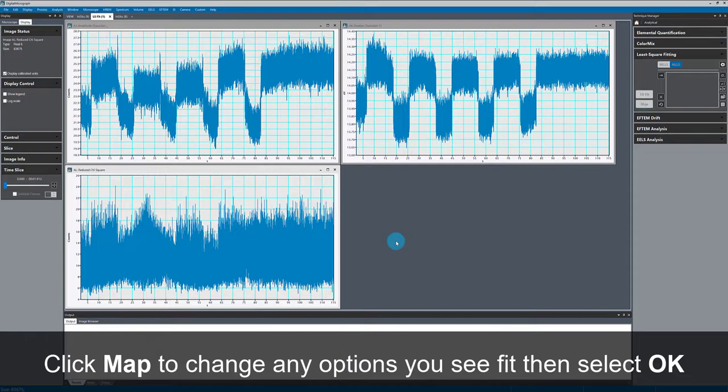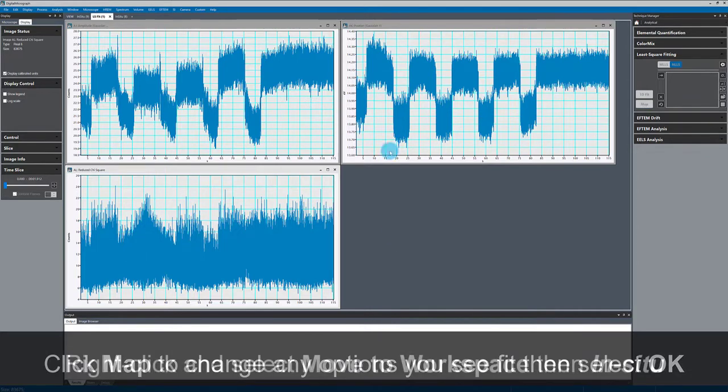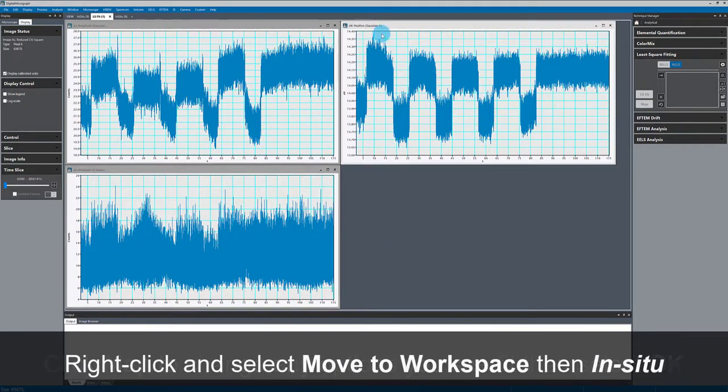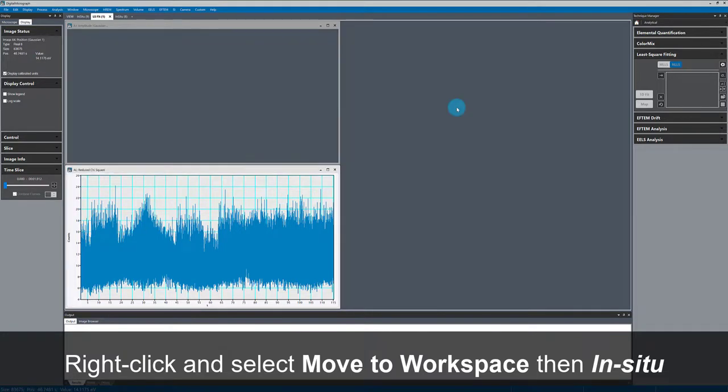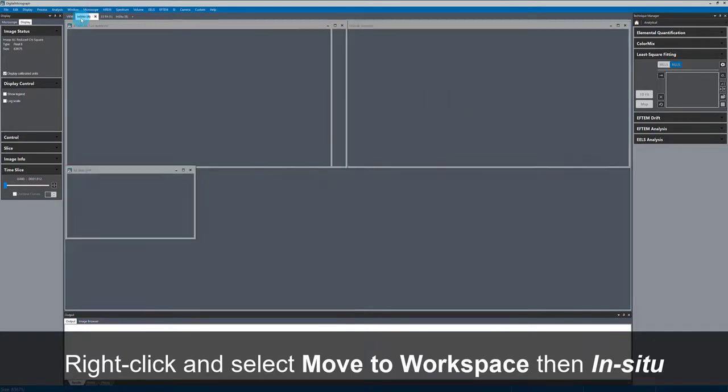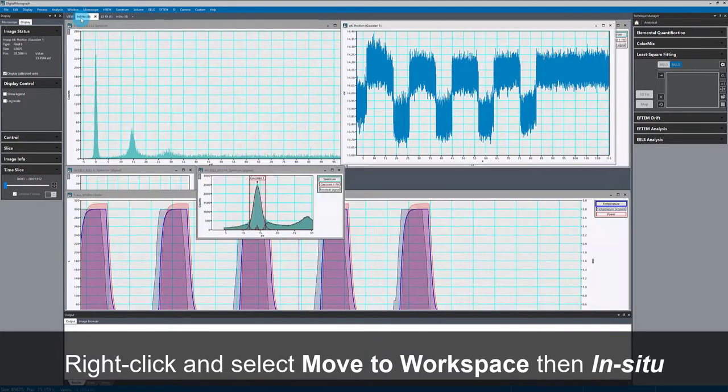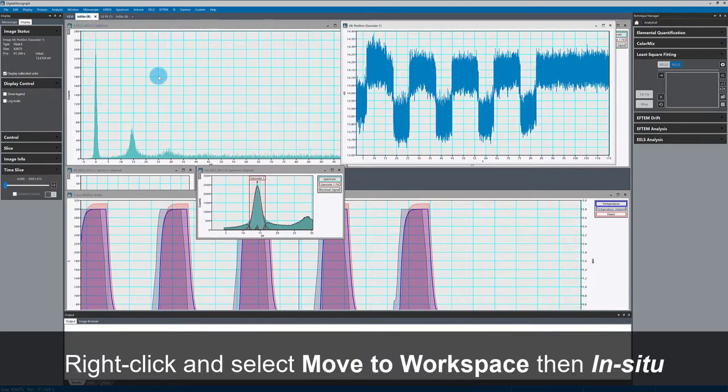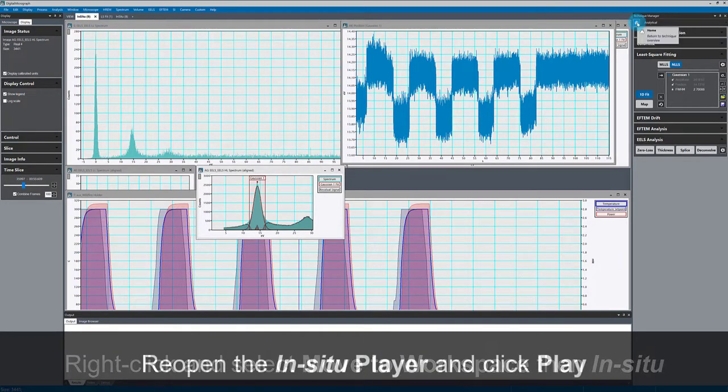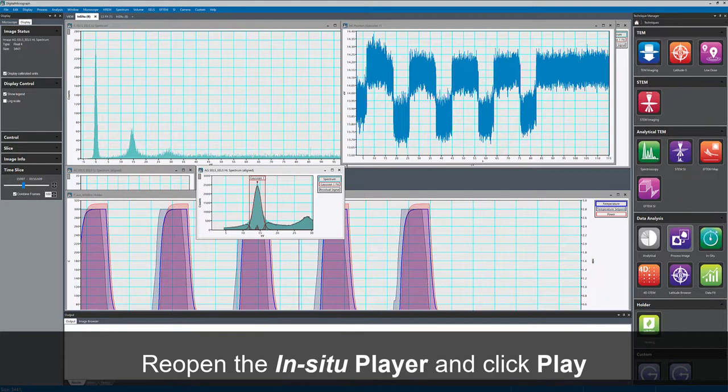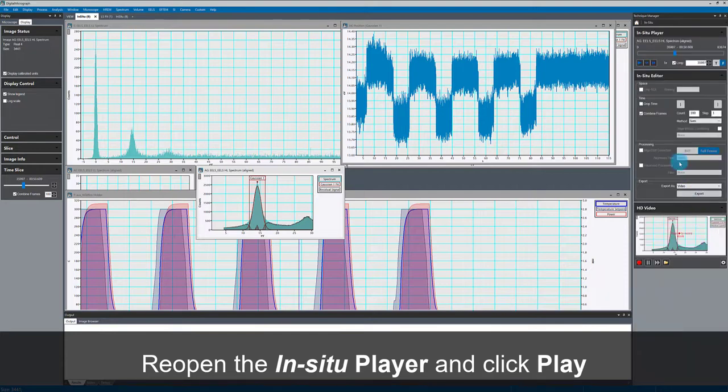And the parameter I'm really interested in is this peak position here. So I'll move that back to my primary workspace. And now we'll see that as I play the data, that measured peak position plot is also synchronized.